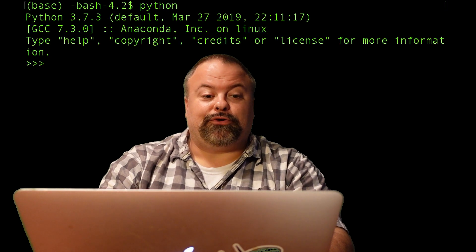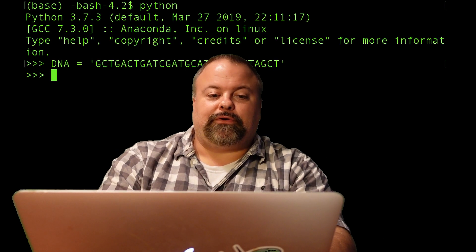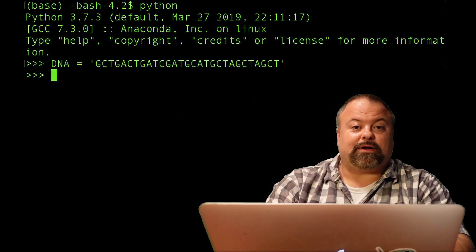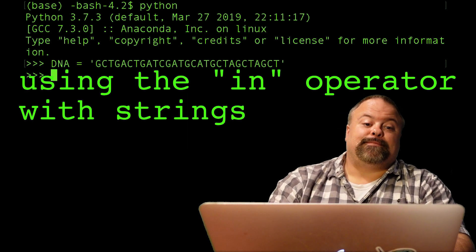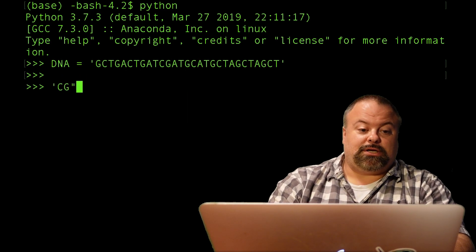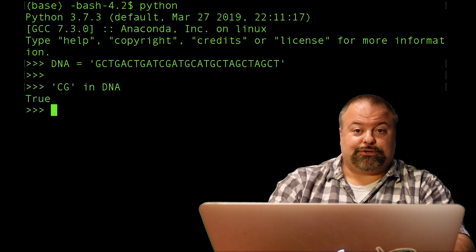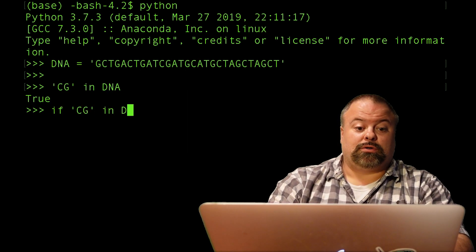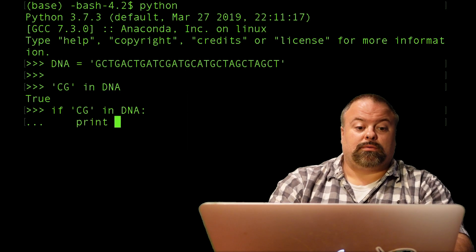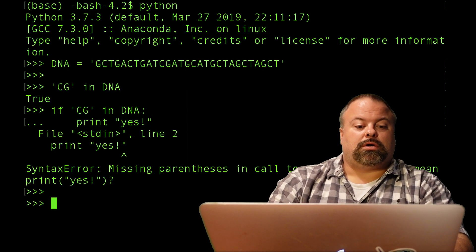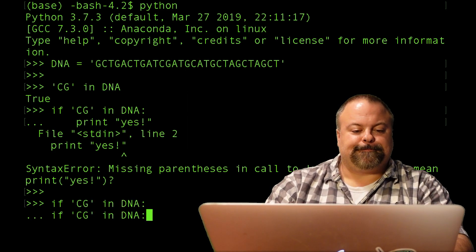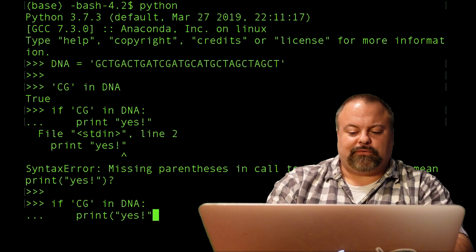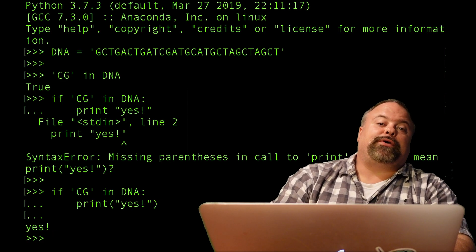So let's start by entering the Python terminal. The first thing we may want to do is define a DNA sequence. We've talked before about how to find whether or not this particular sequence has an occurrence of a particular subsequence, let's just say the CG dimer. So I could say CG in DNA, and that is true.